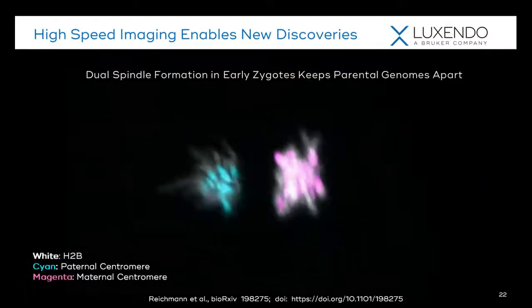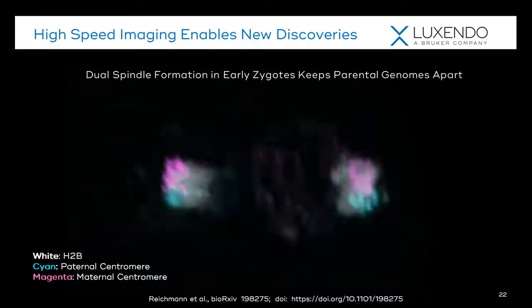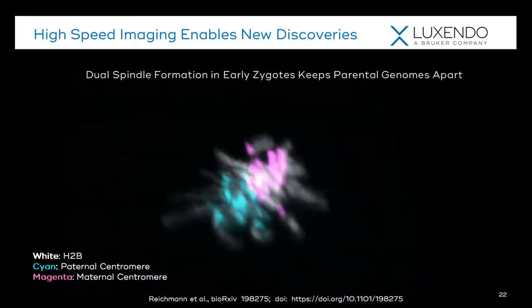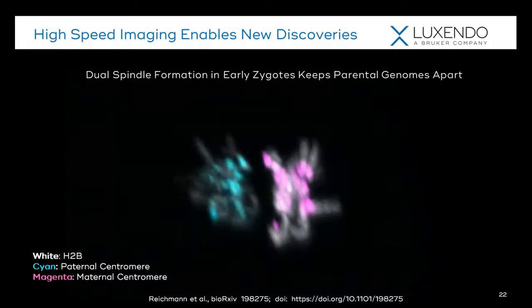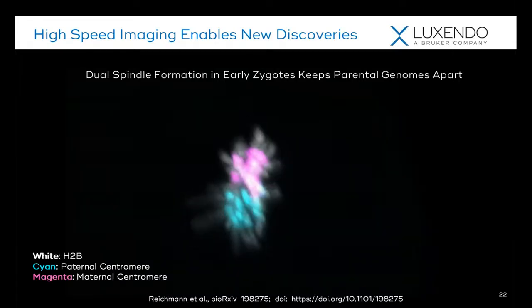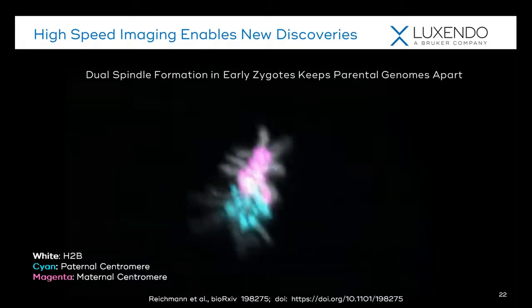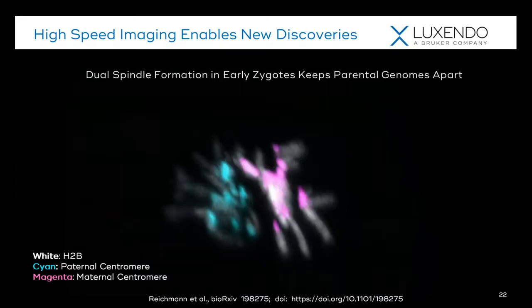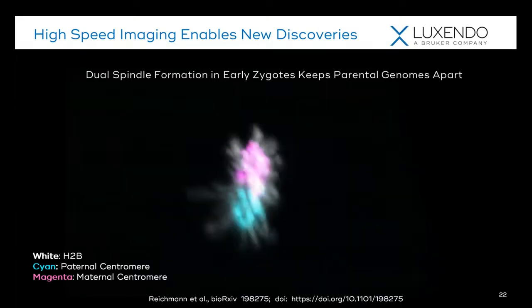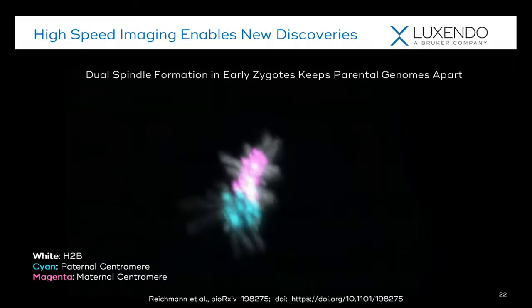And here I'm going to show you a really blown up movie, and it looks a little blurry, but it's blown up way bigger than it should be, showing you when the eggs meet, they're mixing their genomes, and as they pull apart, we'll see that the magenta and the cyan stay spatially segregated even though they've gone into each daughter cell. And the only way that we are able to acquire this data is by using the high temporal speed and low phototoxicity of a light sheet microscope.